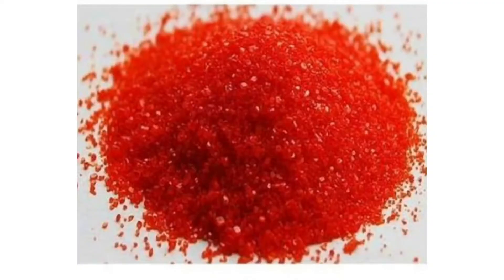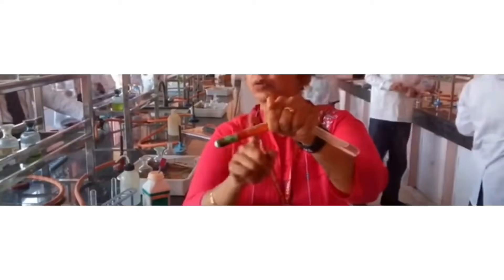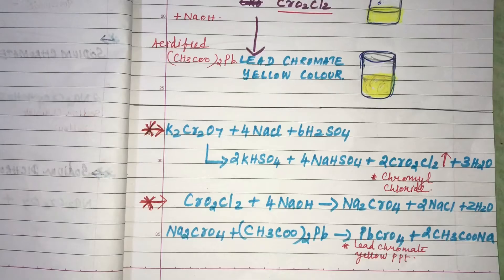This shows the red-orange crystals of Potassium Dichromate, the red-orange vapours produced, and the yellow precipitate formed. Here is the collection of the red-orange vapours in the second test tube.